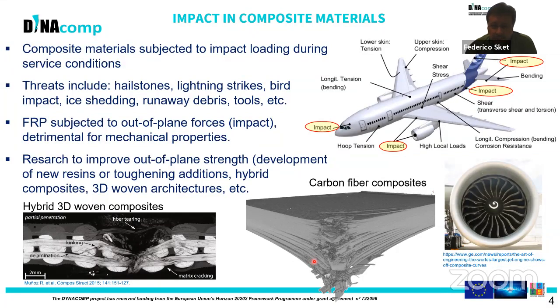And so different strategies have been proposed by different researchers to improve the damage tolerance and the impact resistance of composite laminates, including toughening the resin matrix, 2D and 3D woven architectures, stitching and z-pinning, selective interlayers, protective surface layers, and hybrid materials like the one shown here in this cross-section of a tomography, in which the dark gray is the carbon fibers and the white is the glass fibers, and so on. Still, there is a lot to learn about the different damage mechanisms and impact performance of high-performance composites, and that's one of the reasons for this study.